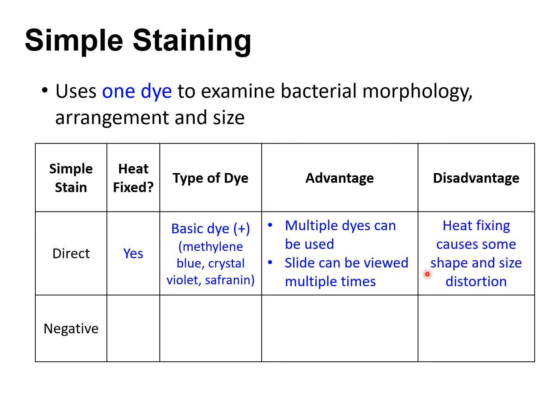A disadvantage is that heat fixing does distort the shape and the size of your bacteria a little bit, okay? So it does distort it a bit. That's one disadvantage of heat fixing.